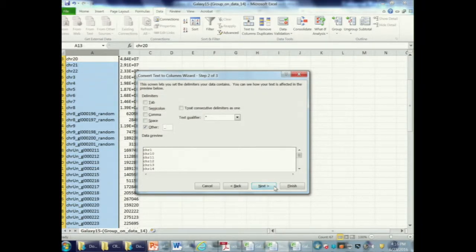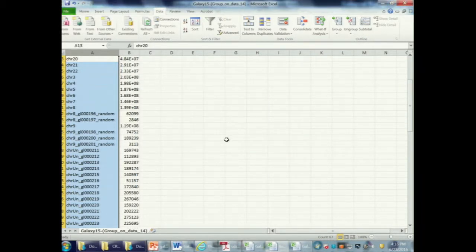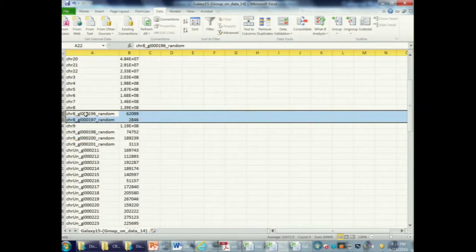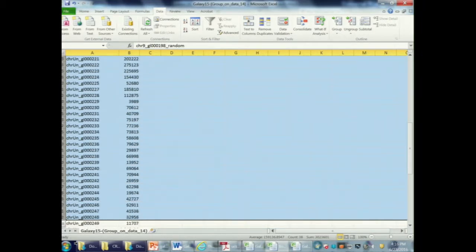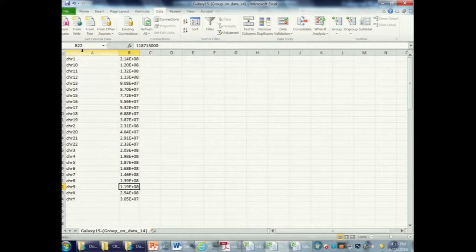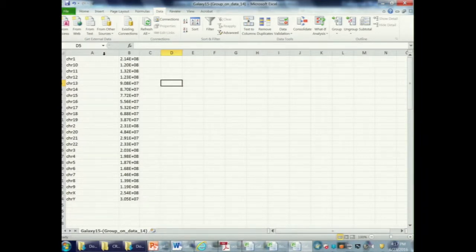Let's try changing that. What's going on here? Oh, okay. It'd be easier in a text editor. I was going to try and get fancy: wherever there's an underscore, that's telling me there's something that's not a regular chromosome, force that into a new column. But it's barely needed. I'm there anyway. Okay, so there's the chromosomes. That's the size. Oh, okay, it does have it, it's just showing it as an E. Okay, so this is our length.